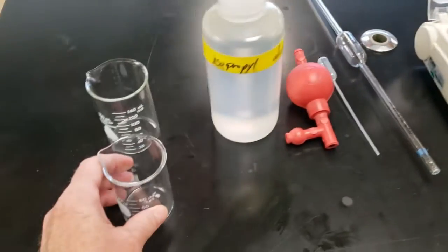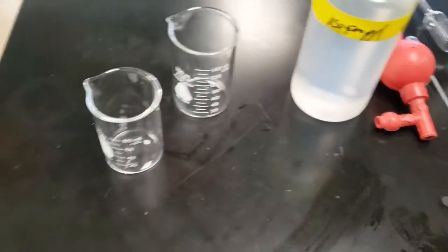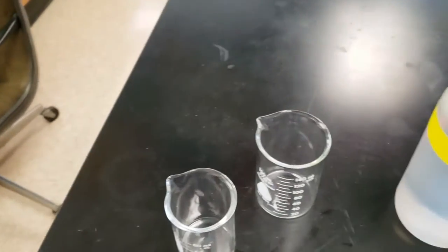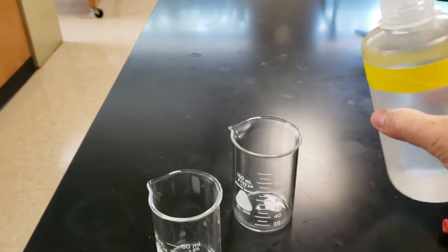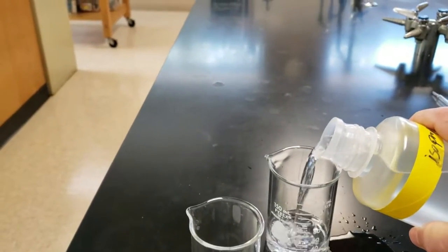Next, we're going to take the beaker off the scale. It's really important. Don't pour things while they're on the scale. And we're going to do our best to put in exactly 20 milliliters of alcohol.